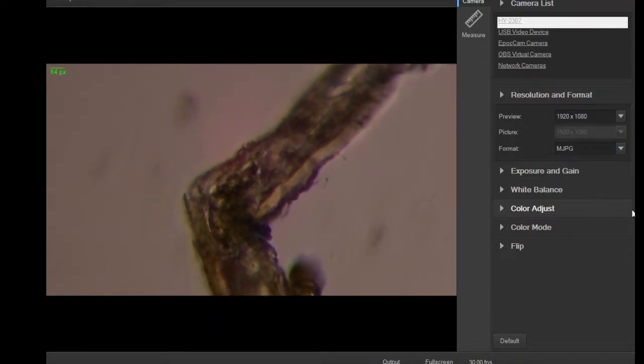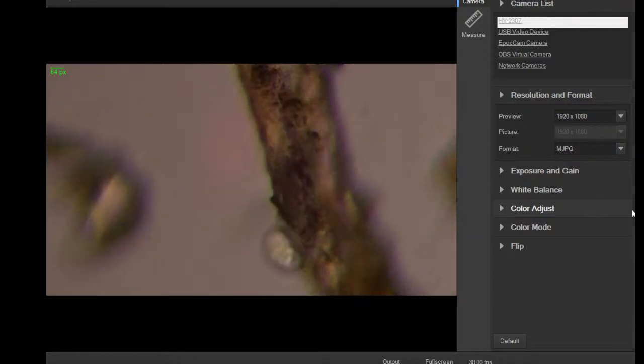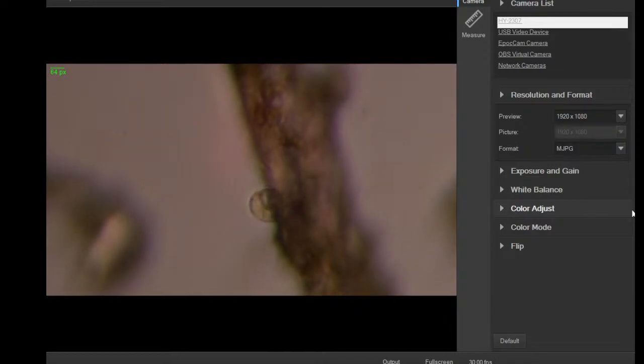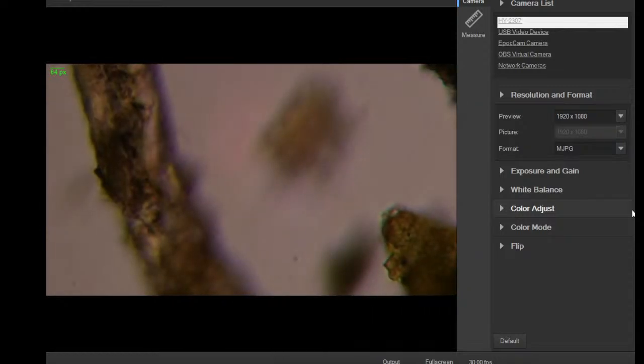This is one of those guys that uses its cilia like little legs sometimes, actually crawling on things, which is interesting. They don't just swim. Come on. Focus. It's hard when I zoom in. This is now 400 power, so this is a pretty small dude in a very small, very shallow depth of field.